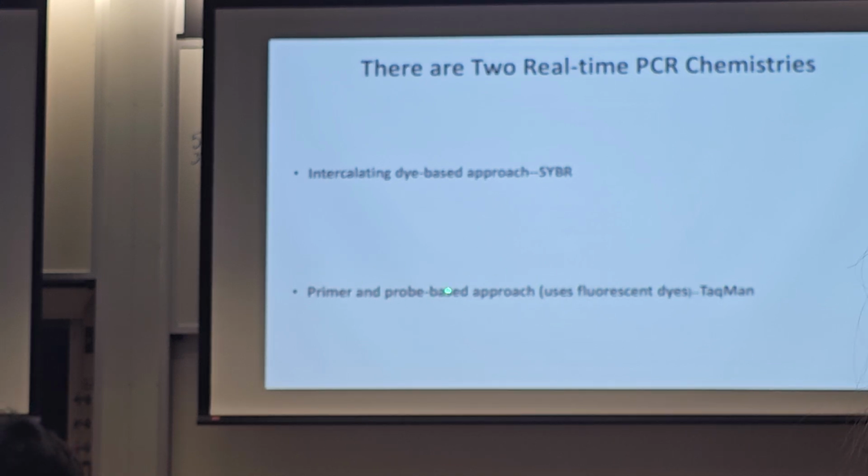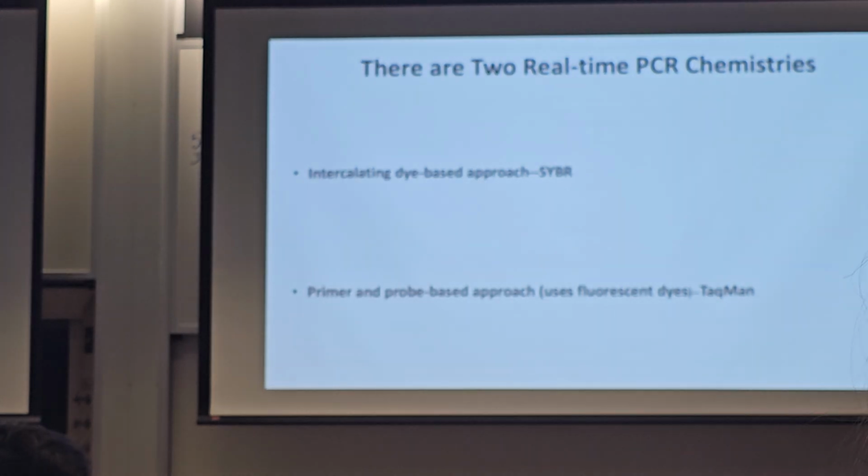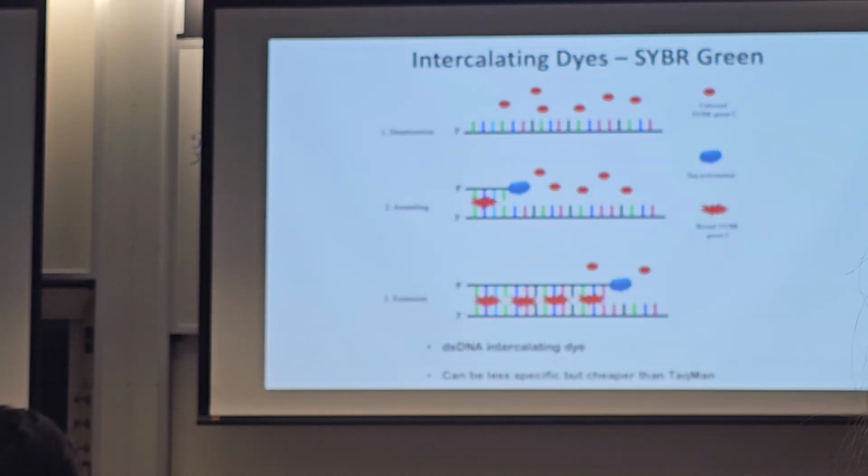We use this in our diagnostics, and this is called the TaqMan assay, or here at Smith we would refer to this as the Taq-person assay, or maybe the Taq-woman assay. So there we go. All right, what are these two approaches and how do they work? Well, here's the SYBR Green approach.